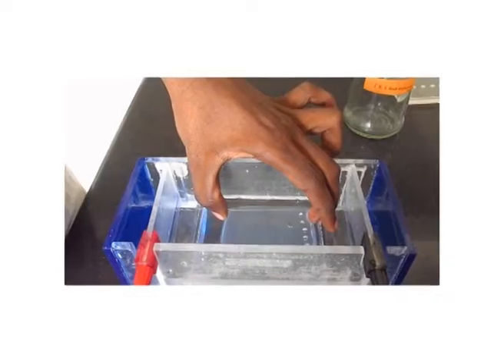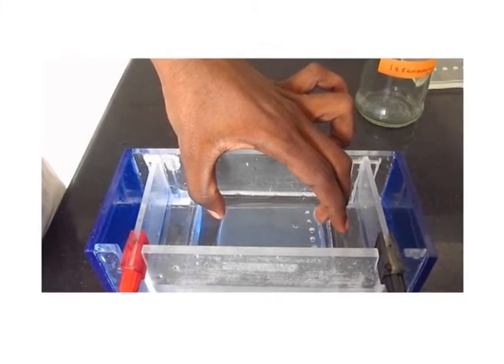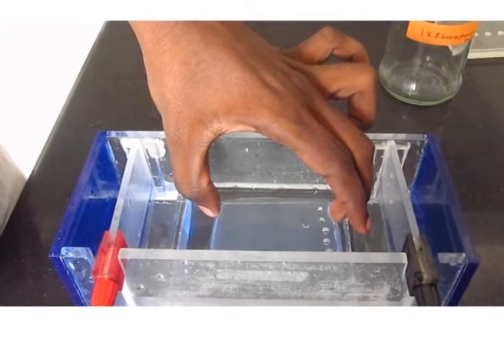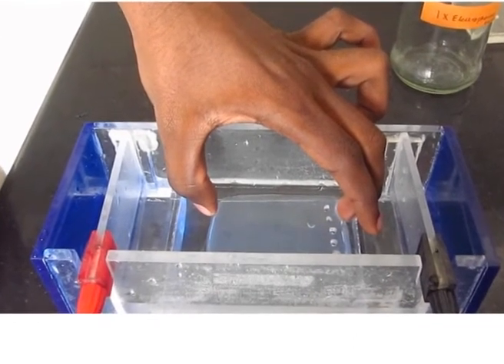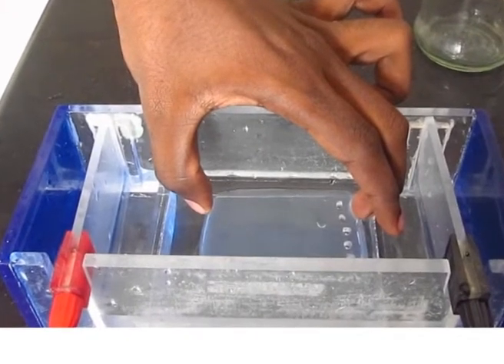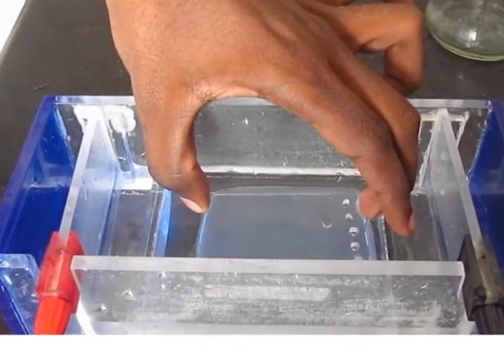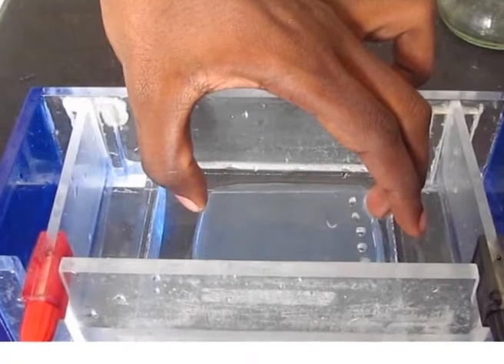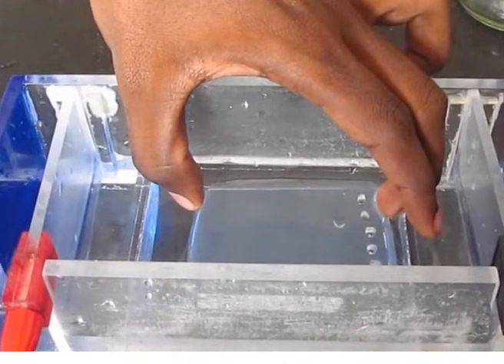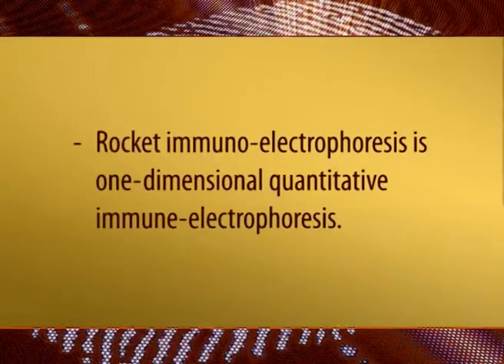Immuno-electrophoresis. Immuno-electrophoresis is a common name for several biochemical methods used for isolation and characterization of proteins on the basis of their electrophoresis and reactions with antibodies. All types of immuno-electrophoresis need immunoglobulins, the antibodies which react with proteins, to be isolated or characterized. There are various types of immuno-electrophoresis.